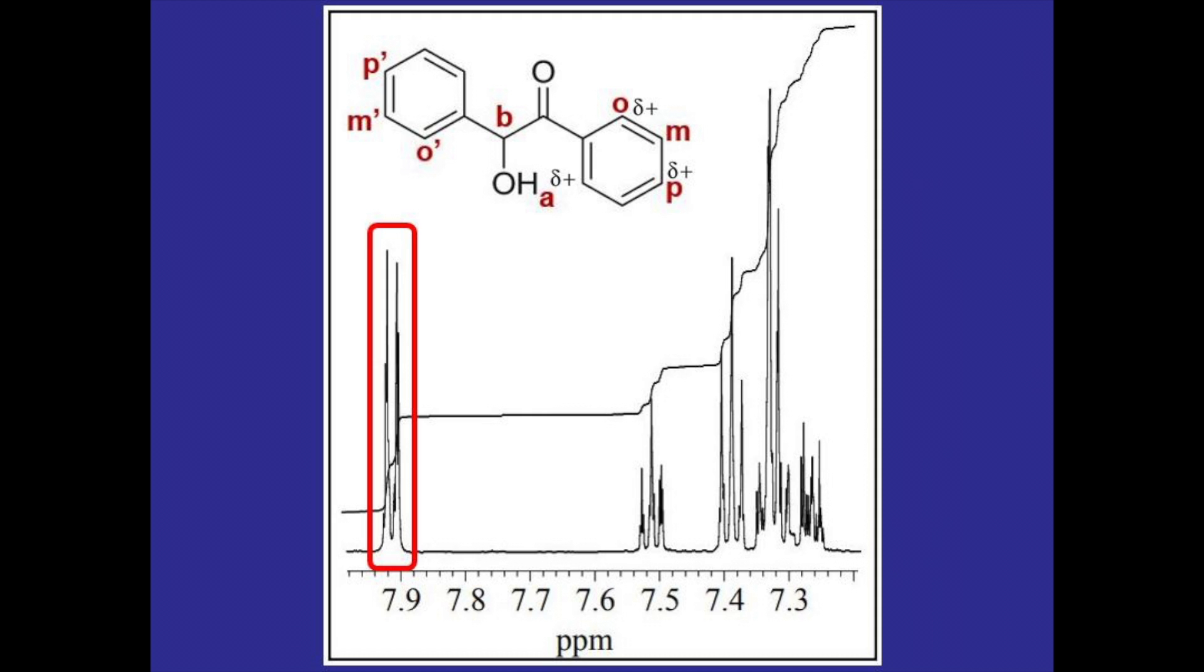And then I'm going to start with the most deshielded peak. It's a clear doublet with an integration that seems to be about twice as big as the smallest integration so most likely two and it's the most deshielded hydrogen so this has to be hydrogen O with that partial positive there.